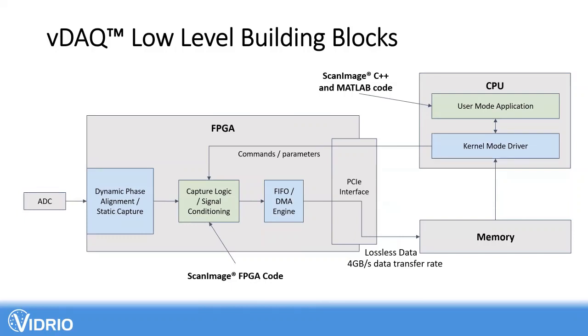This is Jonathan King. I'm going to jump in here. You would absolutely have access to the frame partially as it's being acquired, and depending on whether you implemented some algorithm on the FPGA or in the C++ backend of the ScanImage code, you could have different levels of latency from when the analog signal of the pixel is actually acquired to when you perform some operation on it. But the bottom line is, yes, you can do operations on partial frames. Does that answer the question?